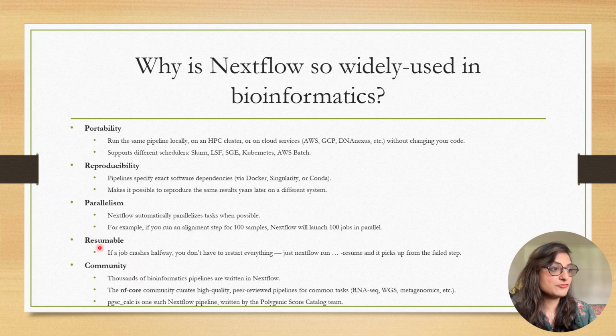And if a job crashes halfway, it's resumable, so you don't have to restart everything. Just run nextflow run with resume, and it picks up from the failed step.